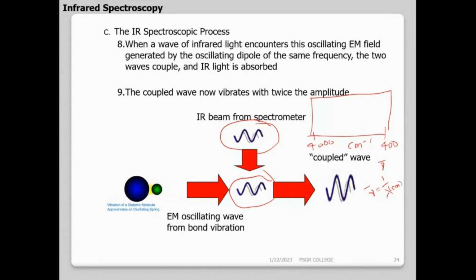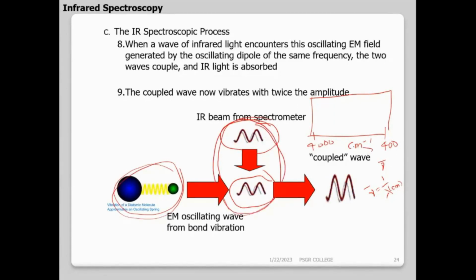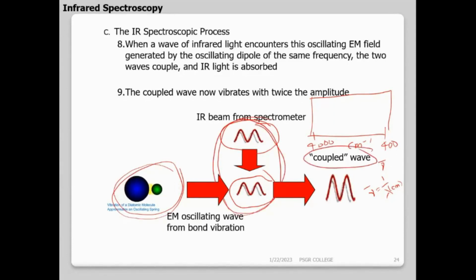Right? Now I give an IR radiation from the instrument, and the molecule is already oscillating. Because it oscillates, it is creating an electromagnetic field. Now these two must match. If both match and couple, I'll be getting a coupled wave. That is what IR is. So they must couple, and coupling means absorption. So if I have this matching, I'll be coupling. Then I'll be getting a coupled wave, and that shows that the molecule is absorbing IR radiation.